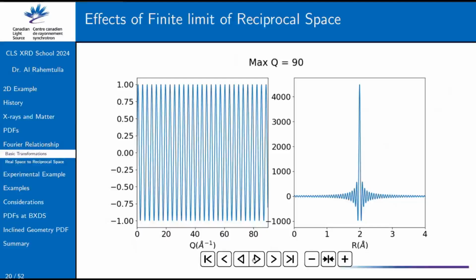So, in terms of peaks, you're thinking of mixing up a termination ripple as a peak, basically. With termination ripples, one is that they're going to be symmetric and they're going to follow the form of a sinc function. So if you are worried that maybe there's a tiny peak that's also buried in there, you can try to fit a sinc function to your primary peak and then compare it out, if you're looking for something very subtle that might be buried within a sinc function.